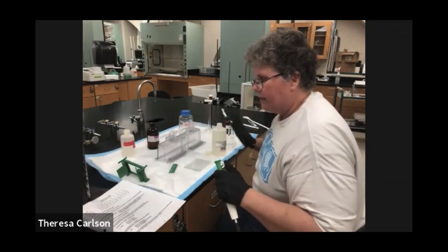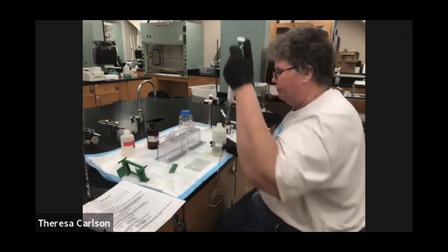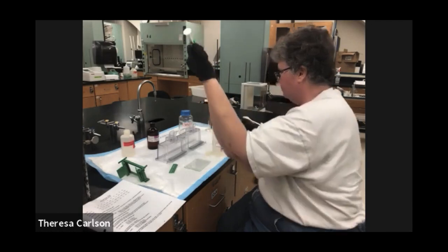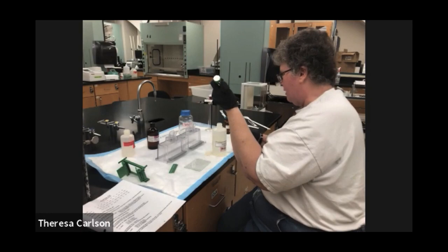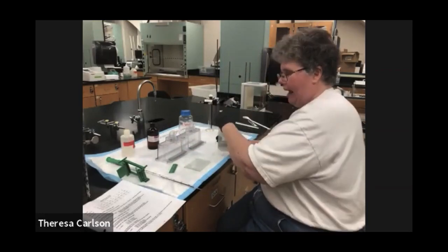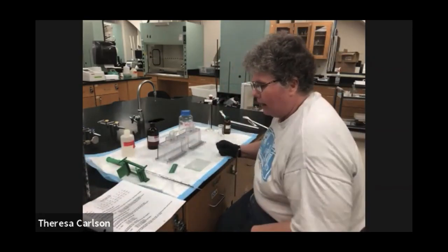Okay, so we had water in here, and we've added our solution A, which is our acrylamide, and now we're going to add solution B. We're going to add 5.25 mL of solution B. Solution A was the acrylamide. Solution B is our Tris buffer, which is going to keep it at pH 8.8, a very high pH for the resolving gel layer that we are currently pouring.